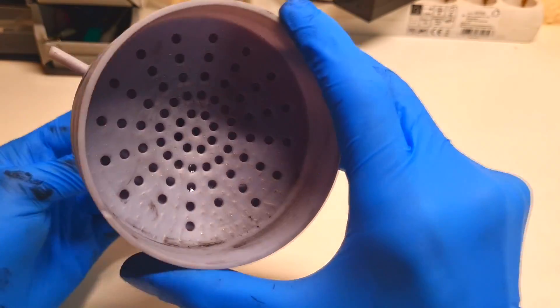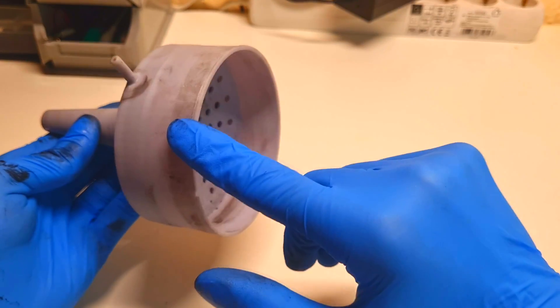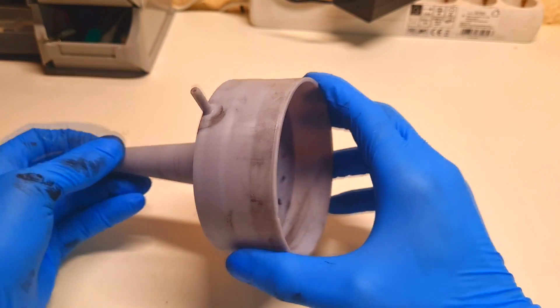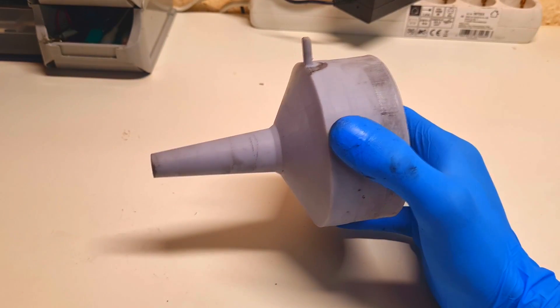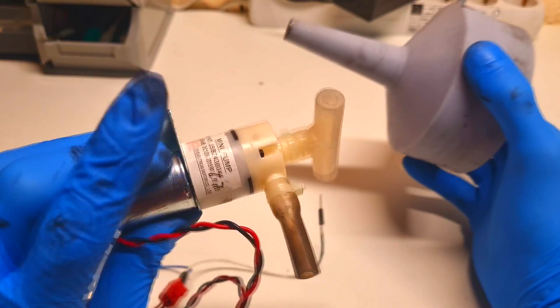So guys, this was my 3D printed vacuum filtration funnel. This one is made from resin — I use ABS-like resin because it is a little bit more resistant to chemicals compared to PLA or PETG. In the future I will also replace this pump with a better one, but for now this one is okay.